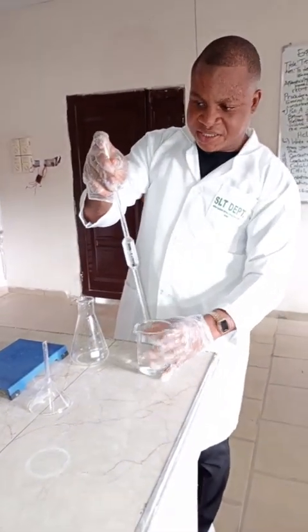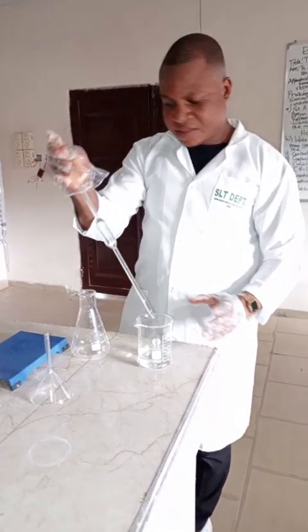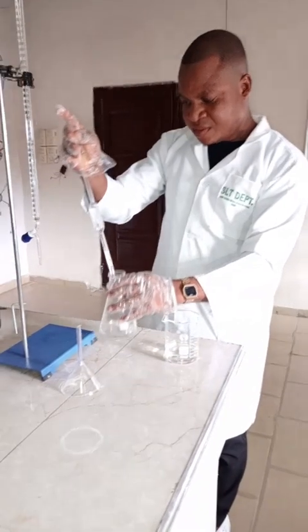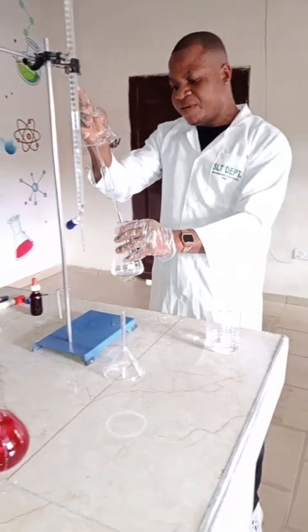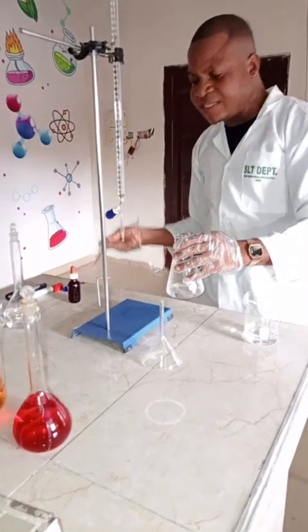Now I'm going to release it. Correct. It's around 25 ml of the base into my titrating flask.